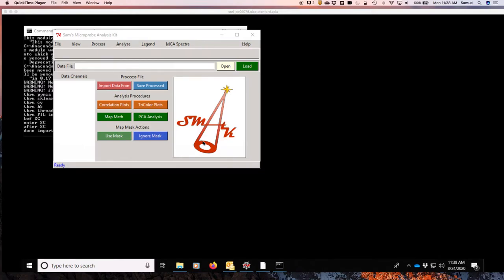In this video, we are going to go over how to use the Simplex volume maximization method to do multiple energy data analysis.